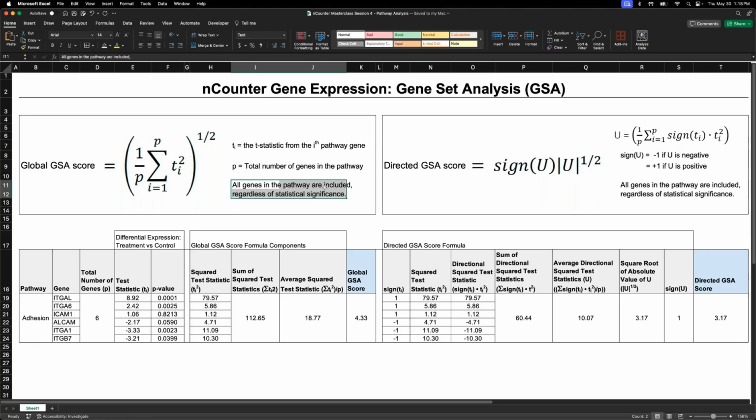So in another type of approach to pathway analysis, such as pathway enrichment, which I'll show you a little later, you are focused only on the genes with a significant p-value, let's say p less than 0.05. Those are the only genes you're concerned with. But in both of these scores, global score and directed GSA score, you look at every single gene in the pathway, regardless of the p-value. So that's the first thing to remember here. Many people are not aware of this, but it looks at every single gene in the pathway, regardless of statistical significance. So hopefully that's clear and that makes sense.